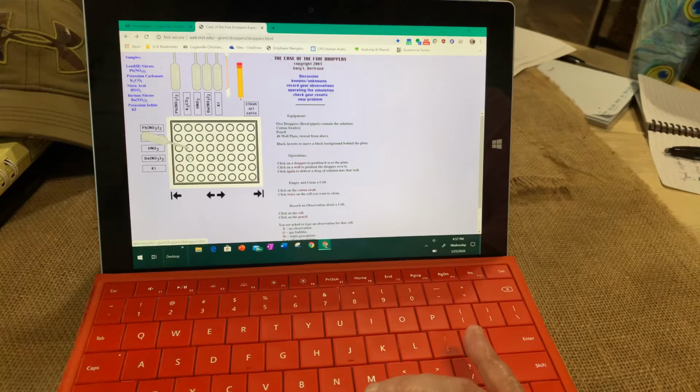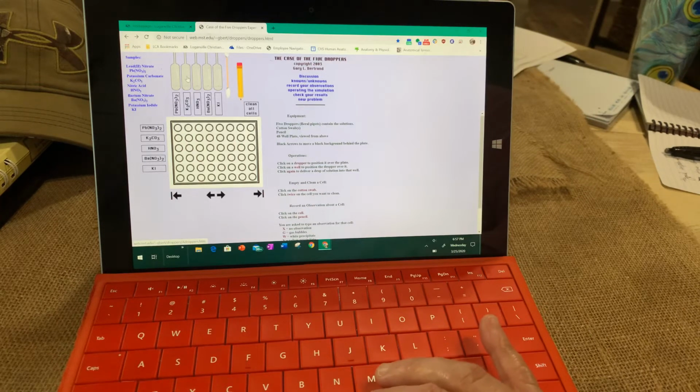And so you can manipulate this to go all the way down, add your substances. Okay, and just to kind of briefly show you just a couple of things about this feature. If I wanted to do the potassium carbonate, and I'm adding it here, okay, then what I'm looking for are chemical reactions as I go.